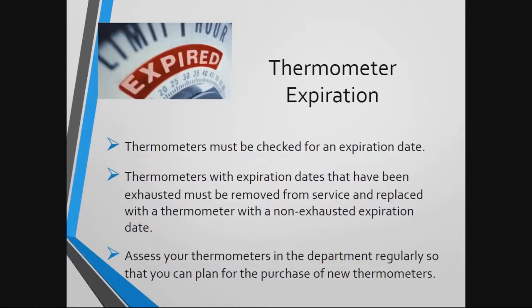As described in the previous two slides, temperature is very important in certain cases, so you can understand why it would be necessary to check your thermometers for that expiration date. Make sure that you have disposed of any thermometer that has expired. Temperatures that are taken with an expired thermometer are obviously technically not valid.